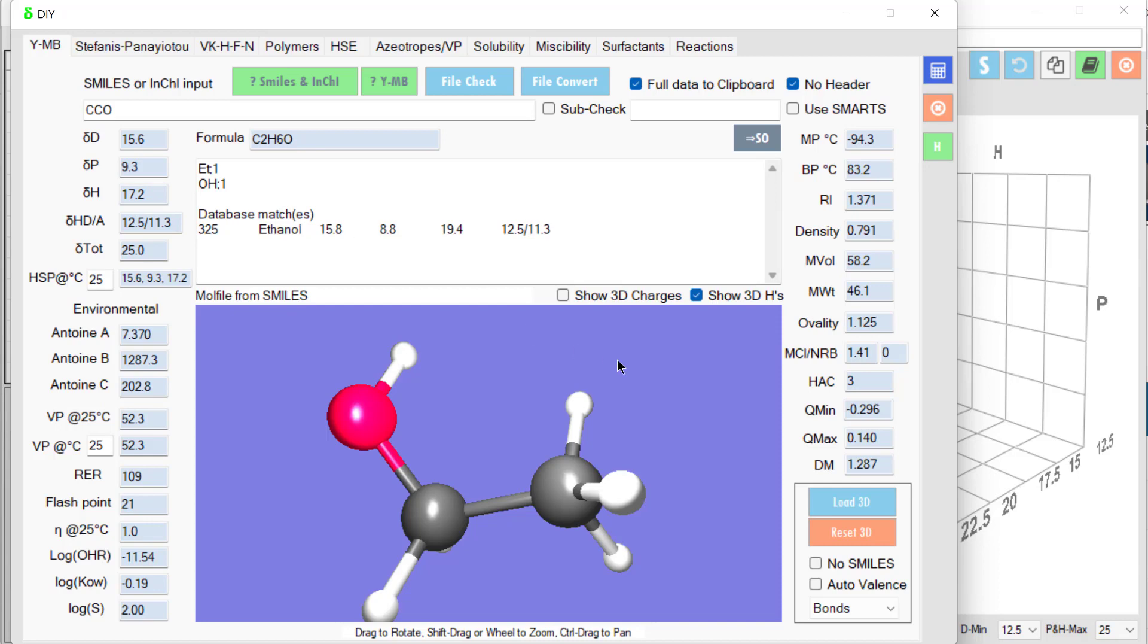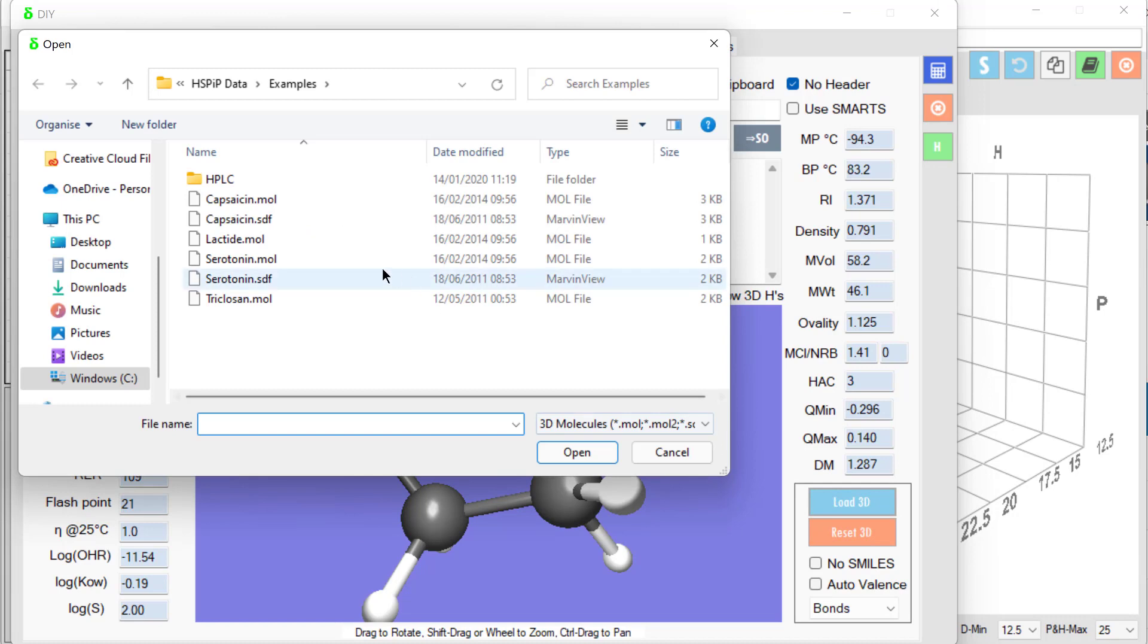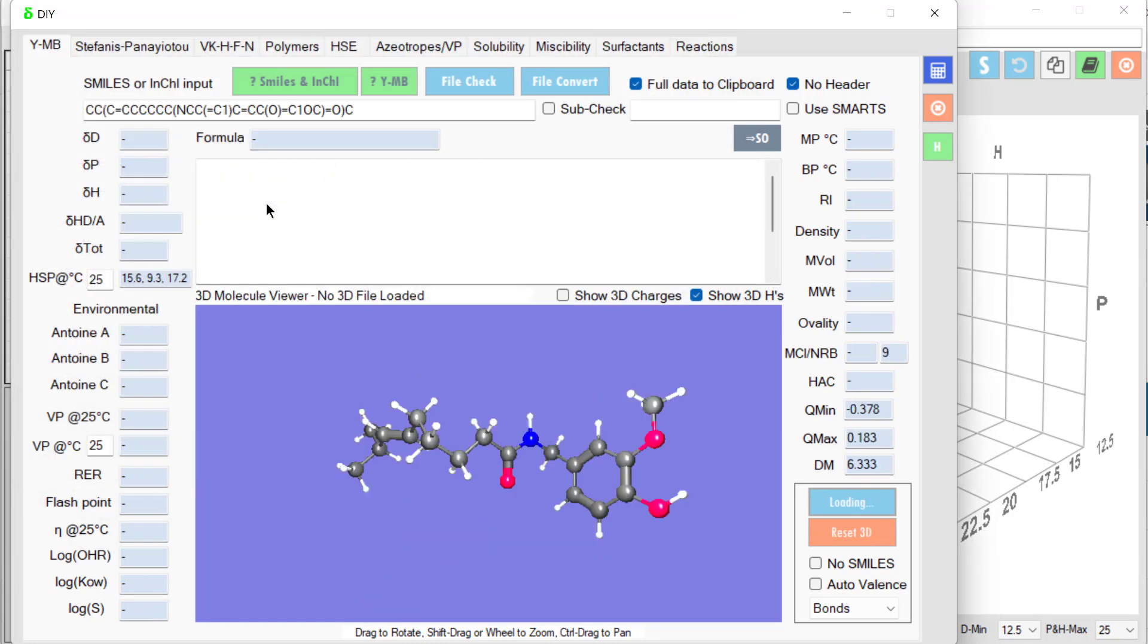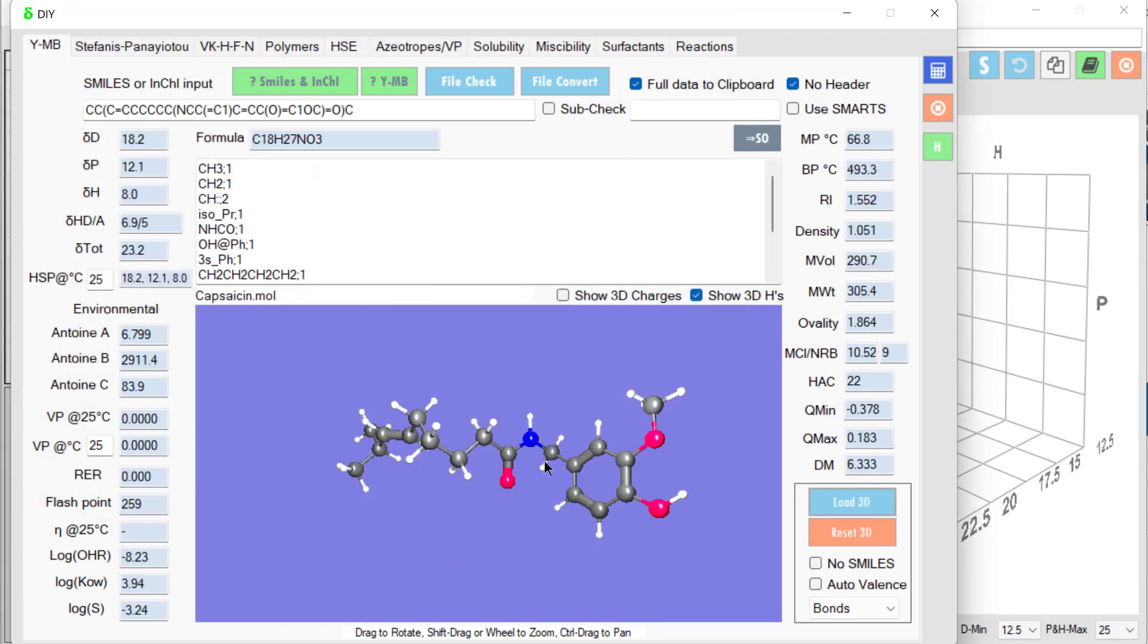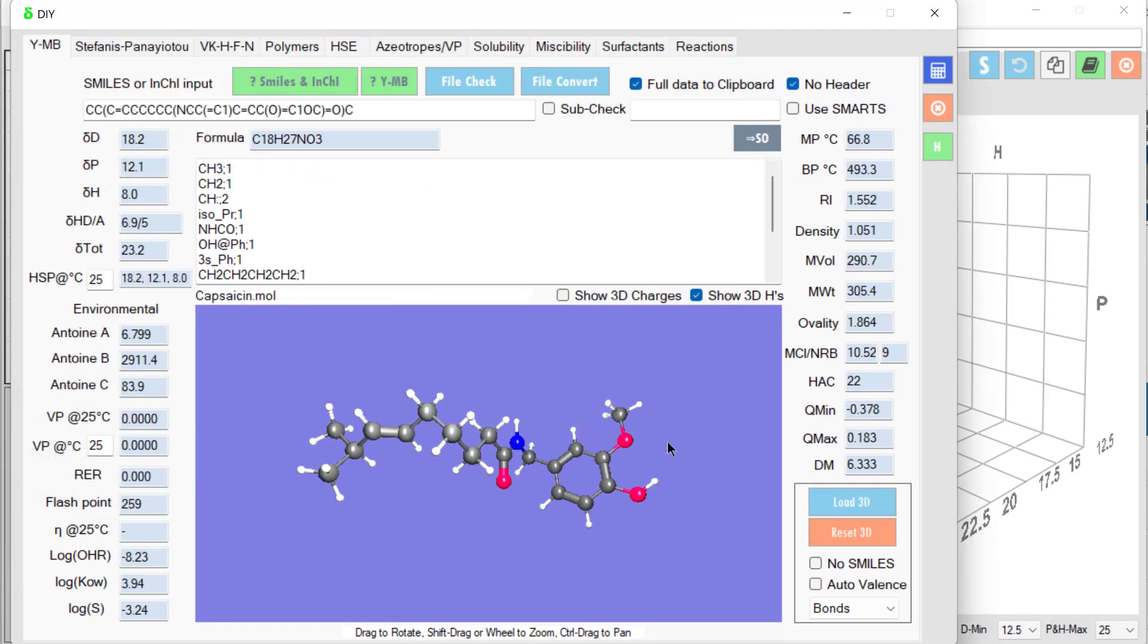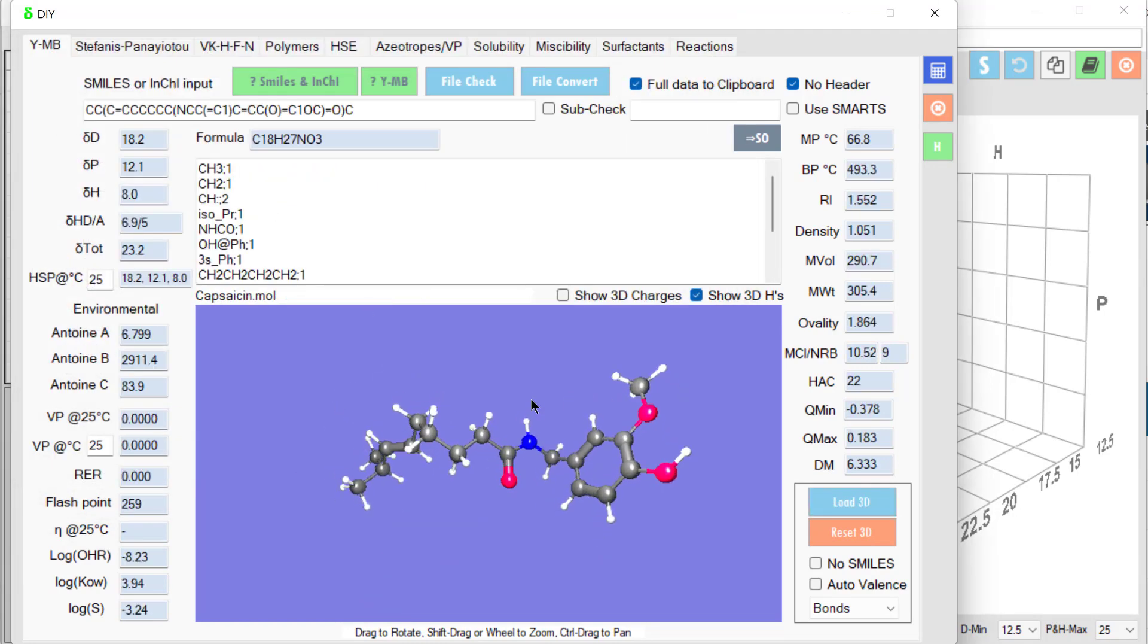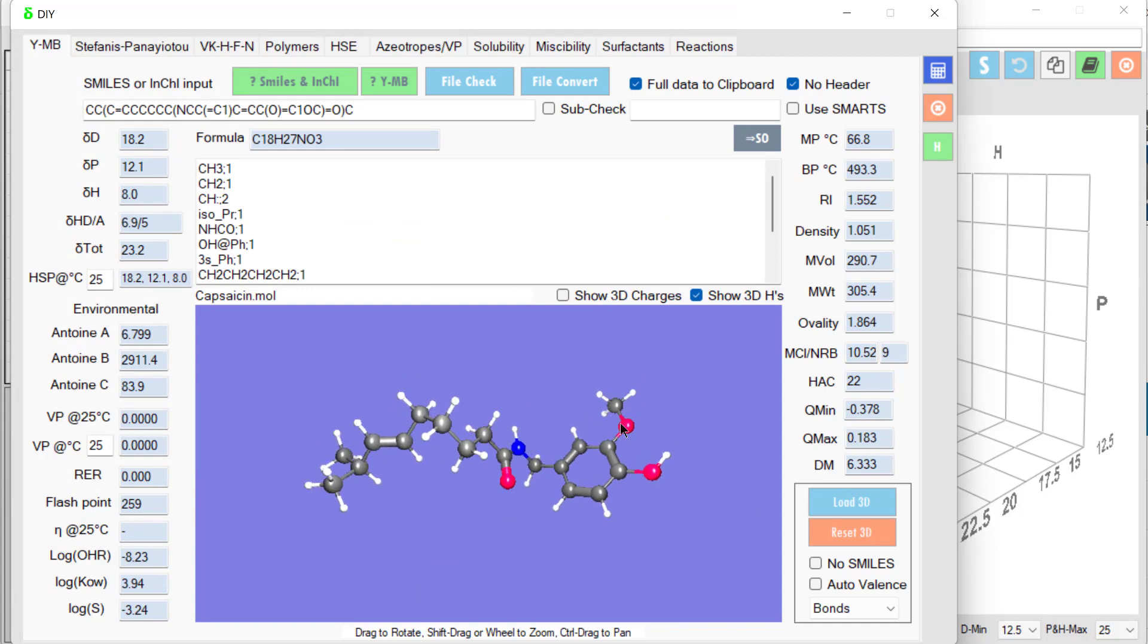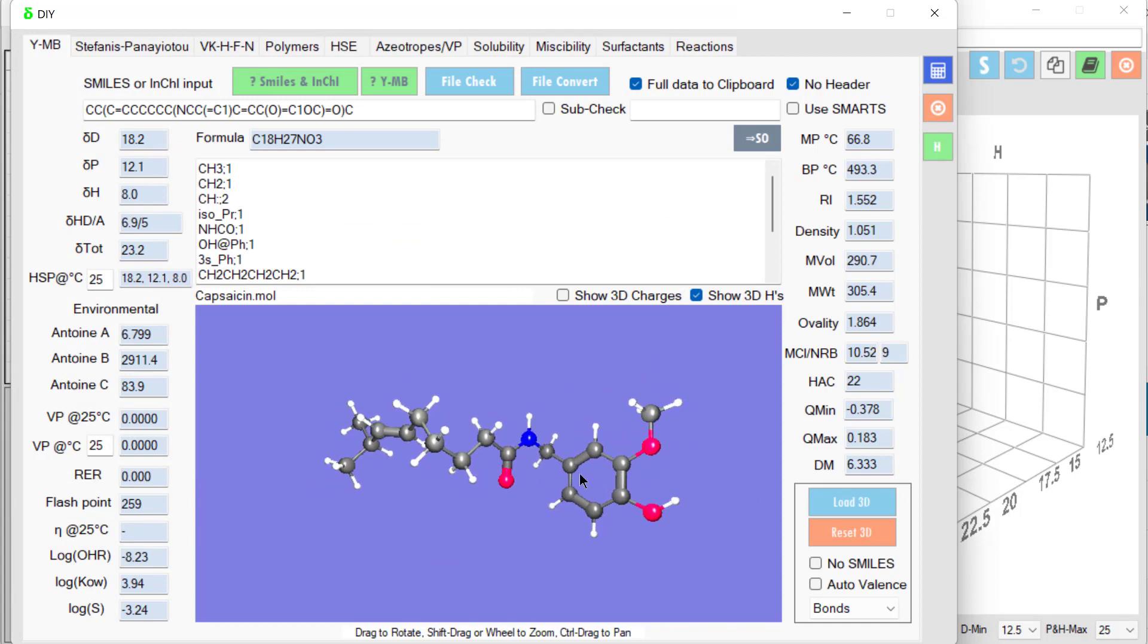We can load 3D structures, for example, capsaicin as a mole file. There it is. That's what gives chili its hot taste.